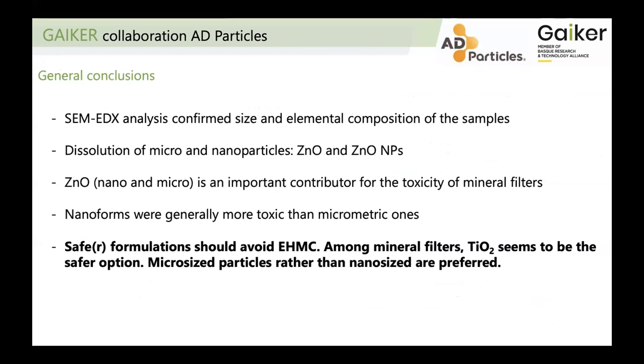So as general conclusions, we could see that SEM combined with EDX analysis confirmed the size and elemental composition of the samples. The dissolution assessments confirmed that the micro and nanoparticles of zinc oxide dissolved quite quickly in the medium, which is in this case marine water. Zinc oxide, both in nano and micro form, are basically important contributors to the toxicity of these mineral filters. Nanoforms were generally more toxic than the micrometric ones.